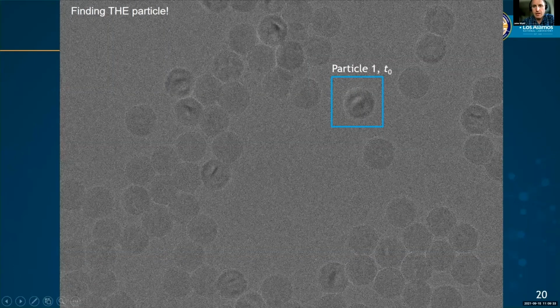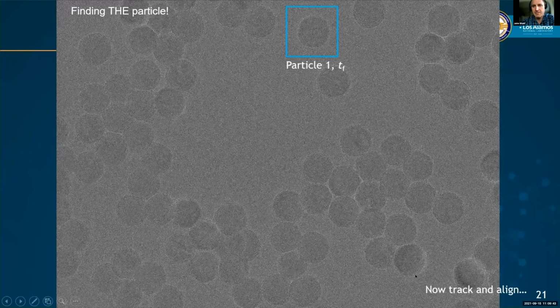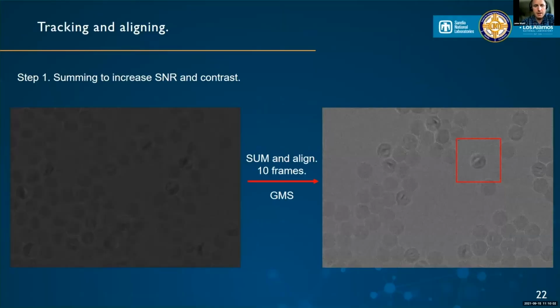And so actually with the K3, even with the field of view, the trick was to find something that was starting down here, at the backside of the vector of the drift, and finishing up here, so capturing the transformation as it went forward. And as I mentioned, there are things now like Axon, which will keep that particle in the center, but they rely on the CETA, so you have to dose your sample quite a bit, which not a lot of materials can handle.